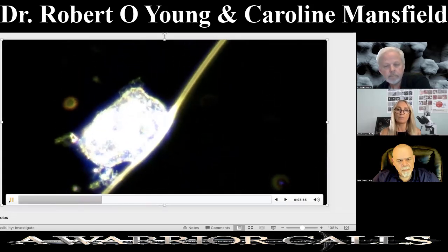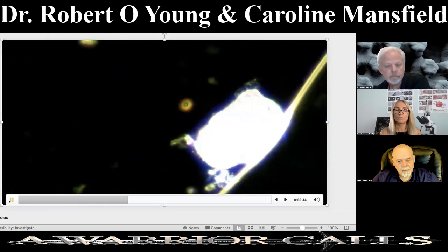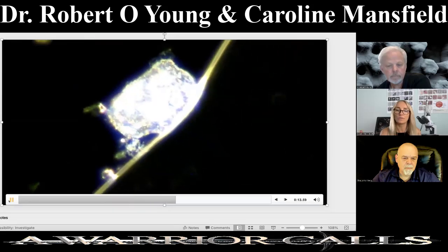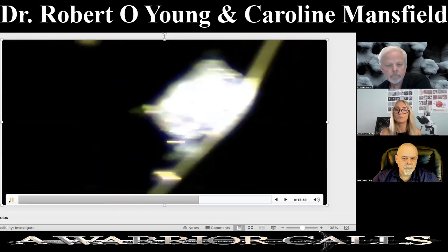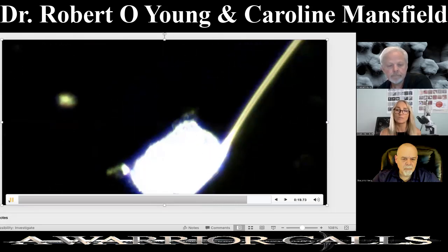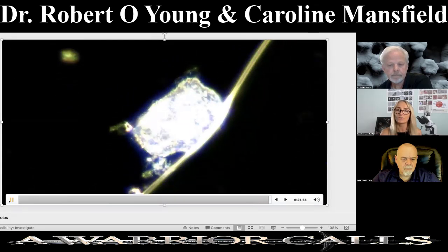But again, somebody may say, oh, this is moving, and it's possibly nanotech. But no, this is just a moving particle in the solution. It's a zeolite crystal being pushed by an air bubble, and it's actually quite beautiful to watch.